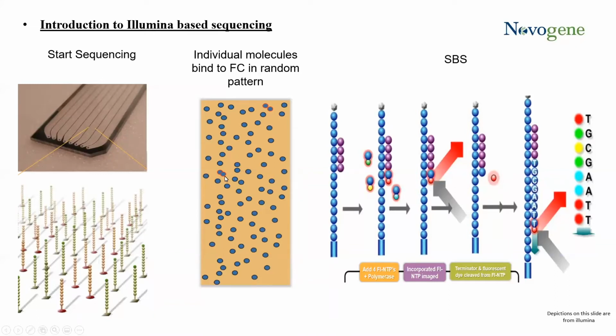And so as we can see, a couple of depictions here show that these colonies don't make the best clustering, and that's okay, because once again, we have some overlap here, and theoretically this colony here and this colony here could be distinct. They could be different, or they could be the same genetic code, but that's okay. We'll be able to decipher this hopefully in the demultiplexing phase. So we've gone from loading the sample onto the flow cell. We've passed cluster generation. Now it's time to sequence.